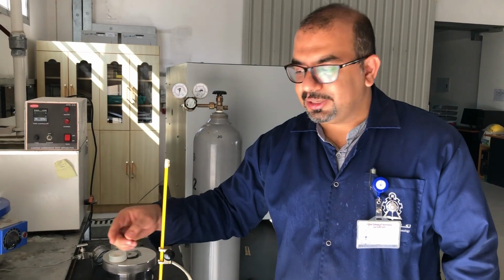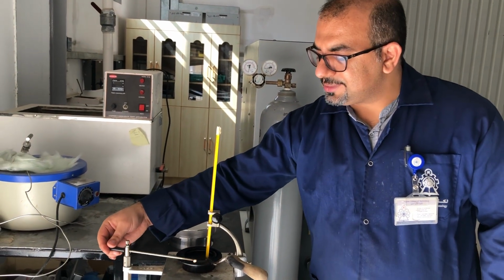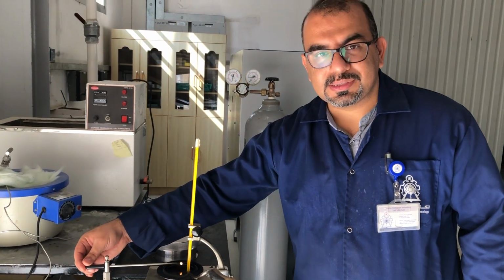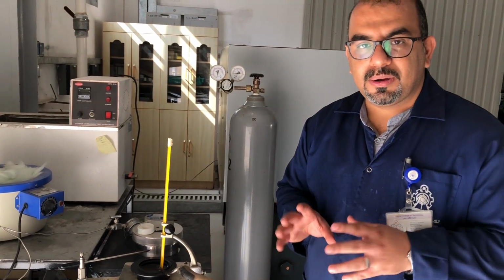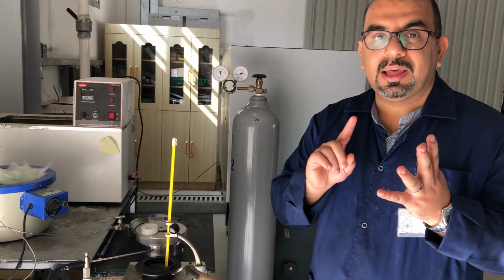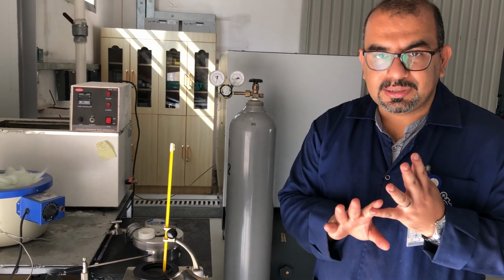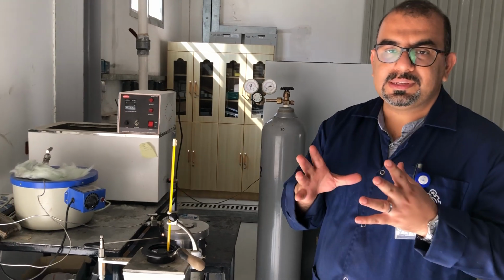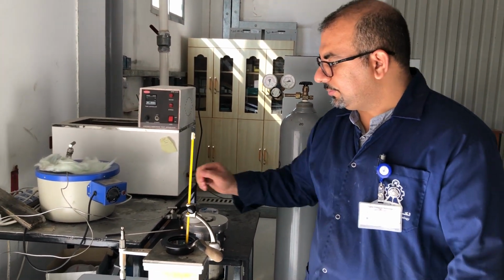Because we want uniform heating, not at one point only. That's why we don't keep the flame here, only passing the flame across the surface. This is the way we do the experiment. It is a matter of observation to find the first temperature at which we see the smoke flashing, and the first temperature at which we see the fire. After we see the fire, we stop the experiment and put the fire out.